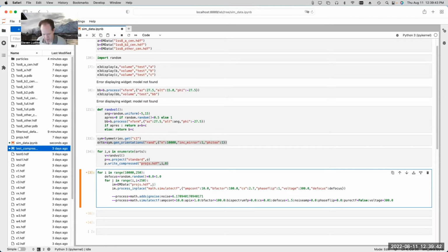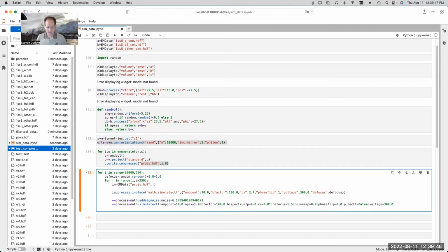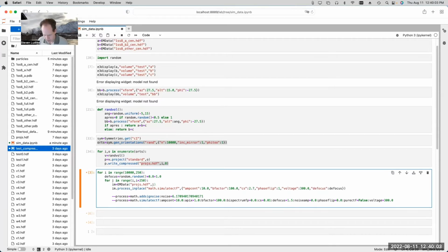Oh yeah, I said I wanted to make the box size a little bit bigger because basically, the images are 0 outside the particle that we've simulated. We don't have any background present already. We can easily just pad the box, and there shouldn't be any real artifacts at the edge or anything like that. So I'm going to go ahead and just put it in here. I'm going to say get clip region, and I think the box size now is 256.